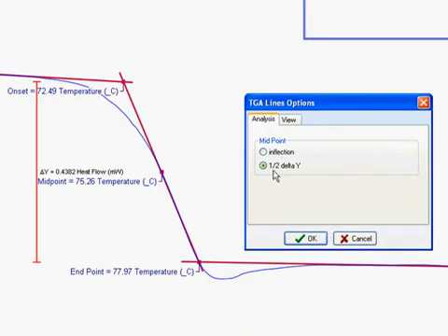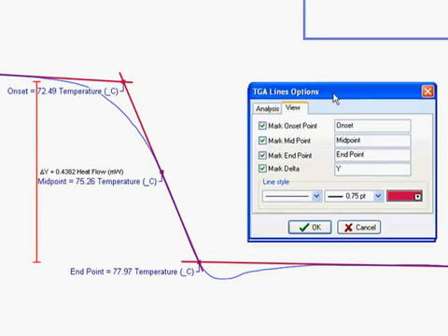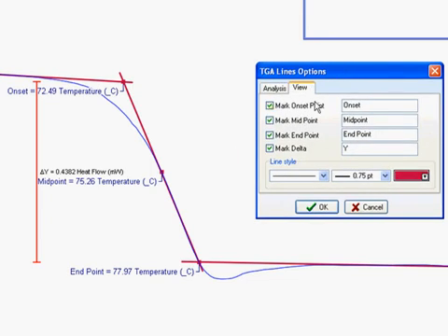The view tab in the options menu allows you to toggle which labels you care to see and how they should read.